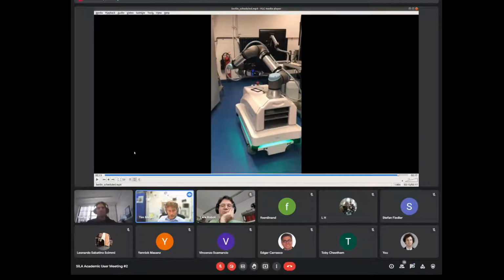And then maybe, sorry to interrupt you. On your list, there was one other point where you wanted to use humans as SiLA service providers. That's very interesting, because that's what we also want to do. Can you comment on this quickly? Yeah, so we have these two solutions for a Berlin Lab or for a Greifswald Lab, where the robots look very different. And if you just imagine, instead of a robot, you have a human.